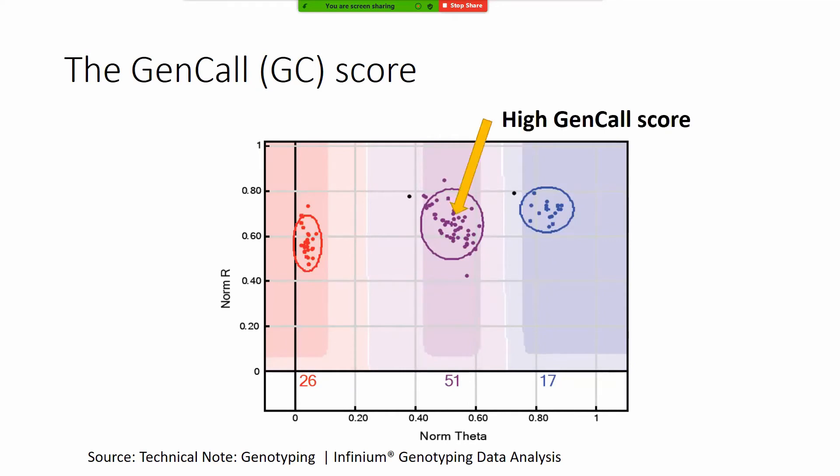The SNPs that are in the center of these ovals are very high quality and we are very sure about these SNPs have high GC score or GenCall score and the others which are very low have a low GC score.